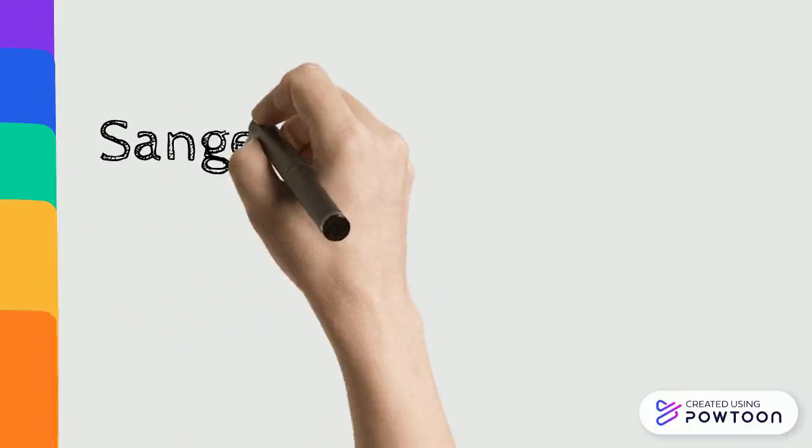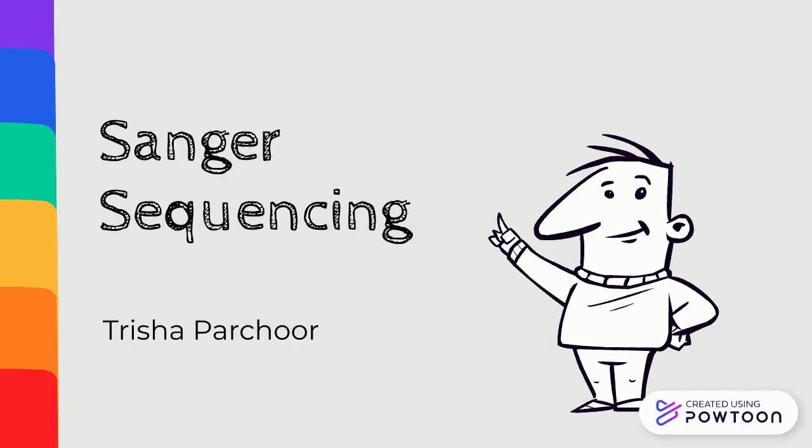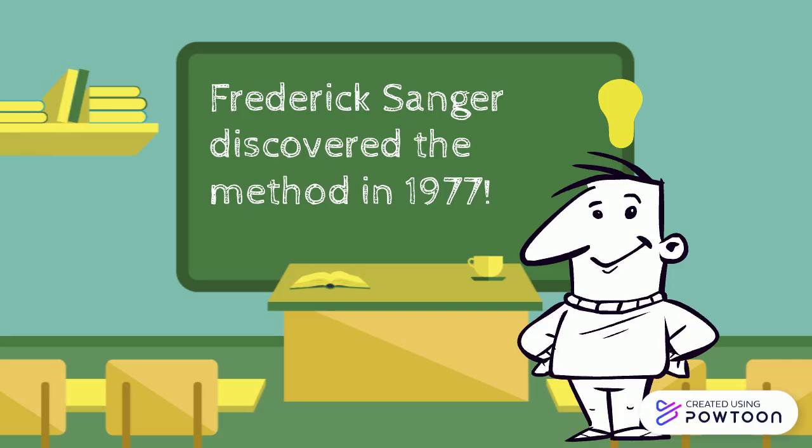Let's talk about Sanger sequencing, also known as the dideoxy chain termination method. This method was developed by scientist Frederick Sanger in 1977, for which he won a Nobel Prize. This method let him sequence the first DNA genome, of the bacteriophage phi X.